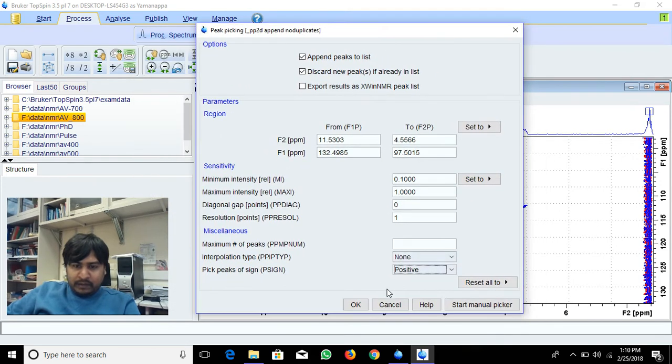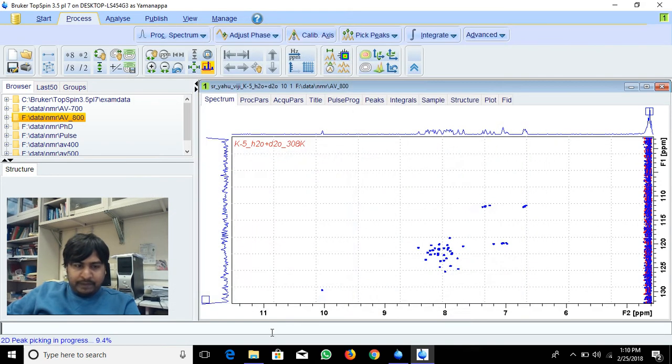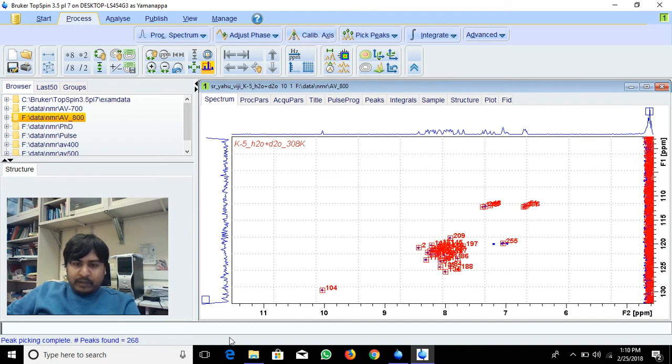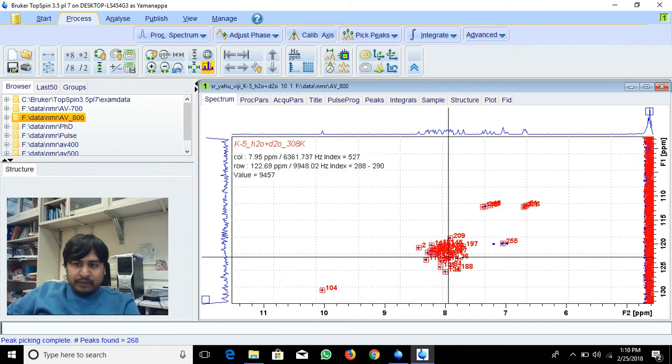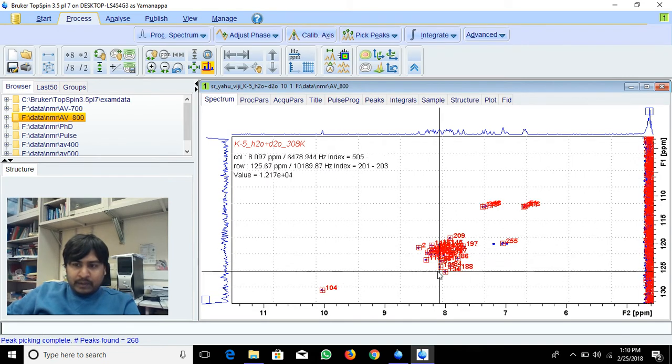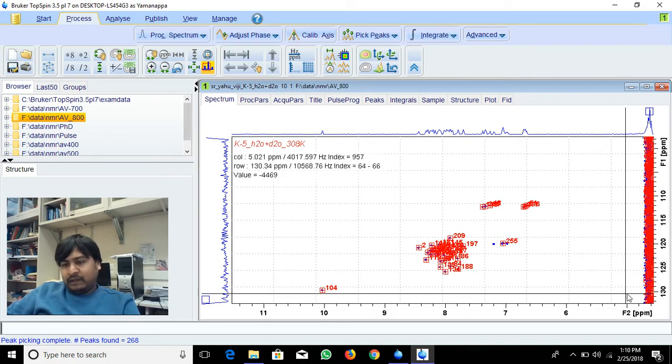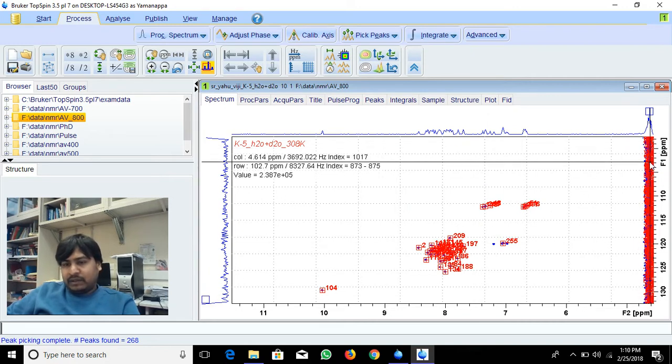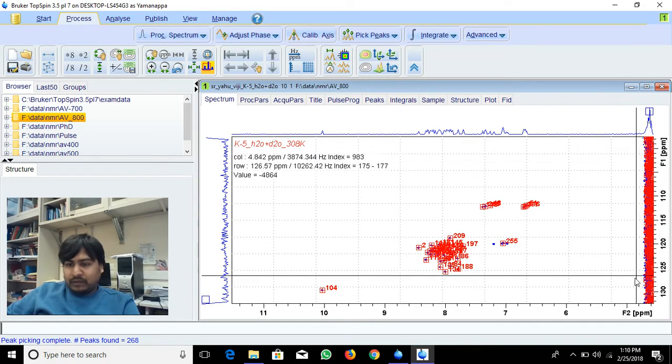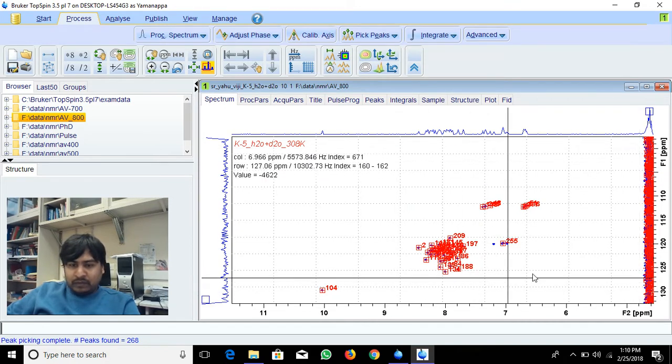See, the percentage is going as it's picking. When finished, it's picked all. Here there's noise, so it picks even noise also. To avoid this noise, we can use another option. I will delete these peaks.